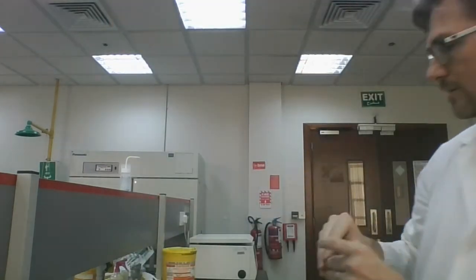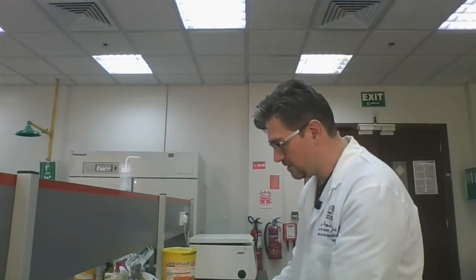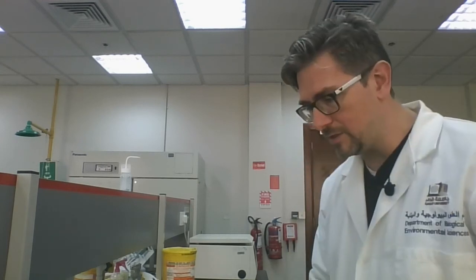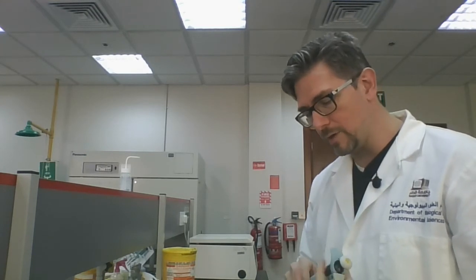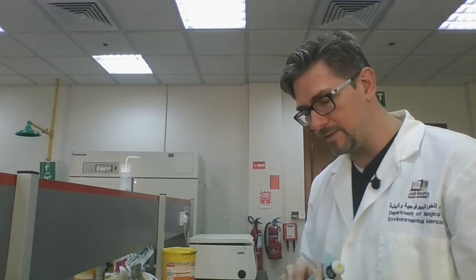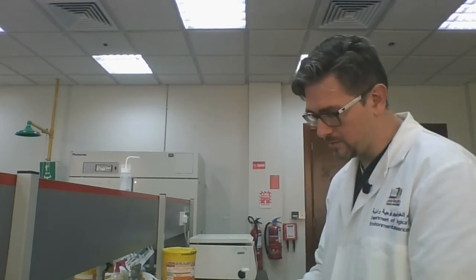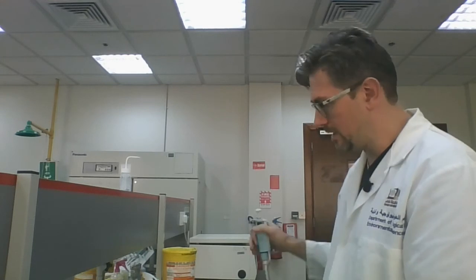Okay. Now that I have resuspended my solutions, my cells, I'm going to go ahead and add 200 microliters of solution B. That's the one that's sitting at room temperature right now, containing SDS. So that's going to lyse our cells and denature our DNA.